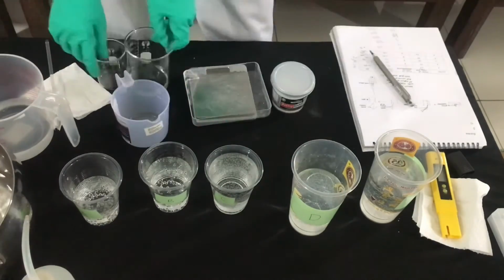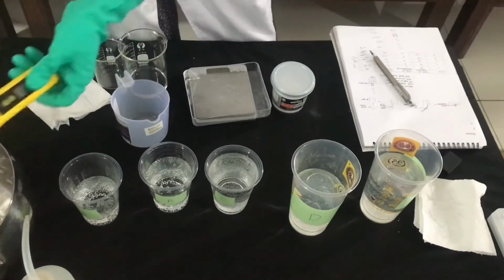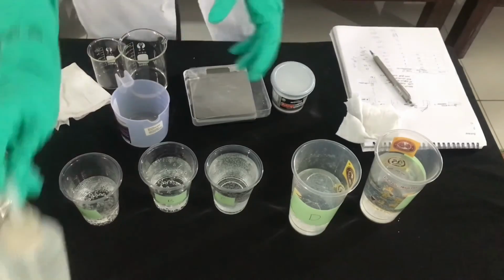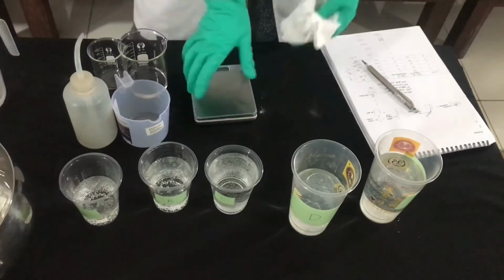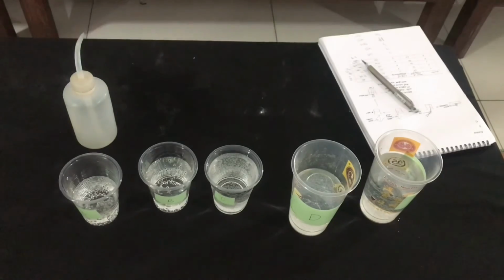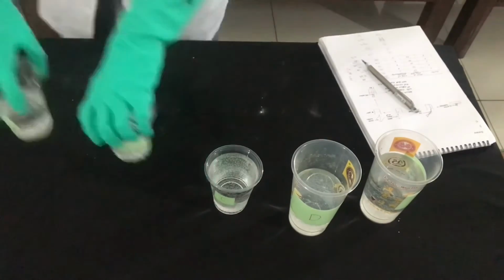Finally, I've done my experiment. My hands were washed with soap and water immediately after finishing the experiment. Even if I wet the gloves, the glassware was cleaned and dried. All the apparatus has been put back in their place, and don't forget to dispose of lab waste properly. I also cleaned and wiped the experiment table.